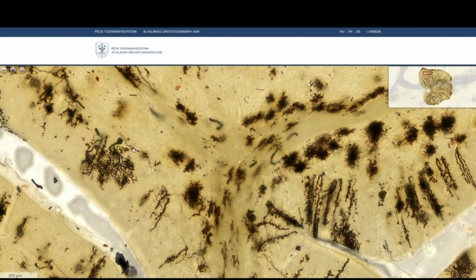With this magnification, you can see much better the previously mentioned Purkinje cell, the dendrite tree in the molecular layer, and the carrot-like quite large cell body. Under the Purkinje cells, in the remaining gray matter, you see quite messy cells. These are astrocytes, because this is still in the gray matter. These are protoplasmic astrocytes. More inside, where you see this part of this slide, this is white matter.